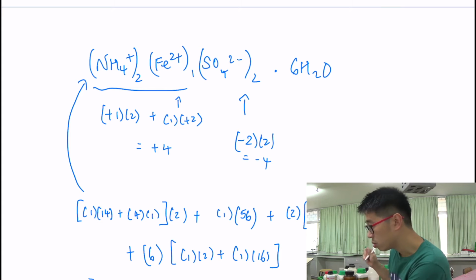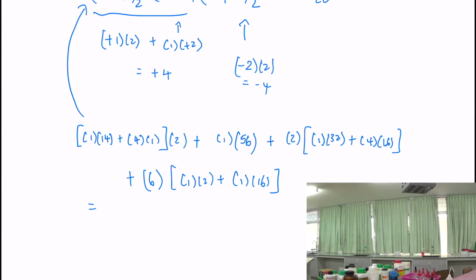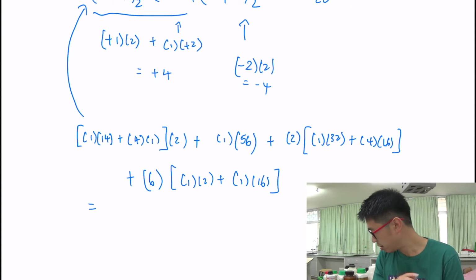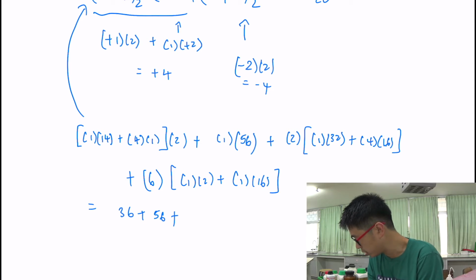Okay, and you do all that on your calculator, which I forgot to bring. Anyway, I won't be doing a lot of calculations, so I'll just be using my phone. In fact, this is the only molar mass calculation I'll show you, just to recap what we have done in the other tutorial videos on the water of crystallization stuff. Okay, so I want to focus more on qualitative analysis in this video actually, so let me just quickly get this done.